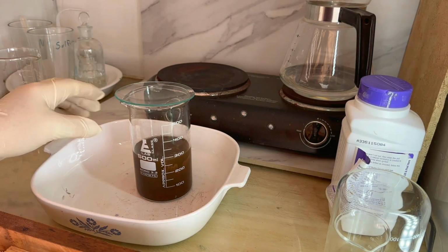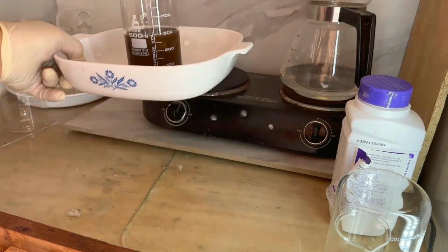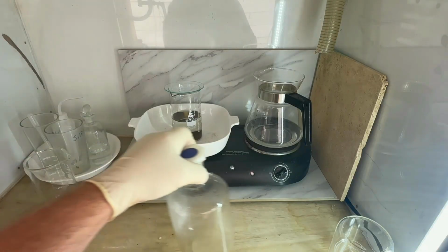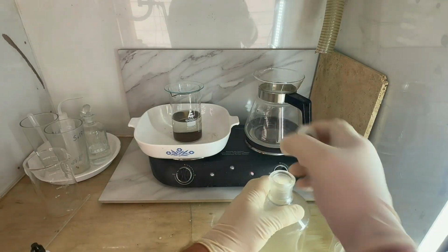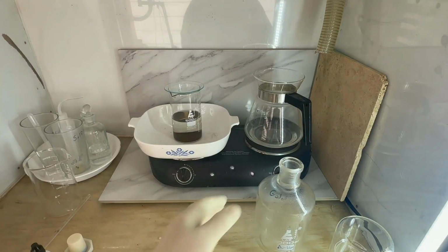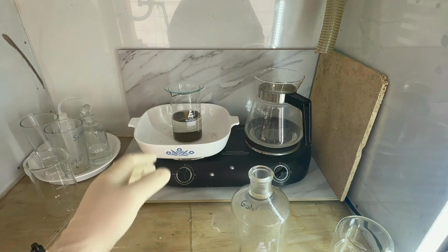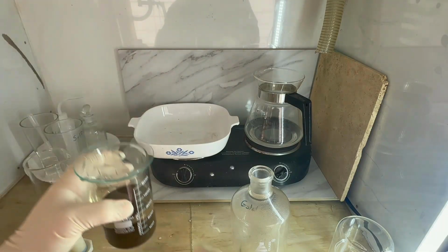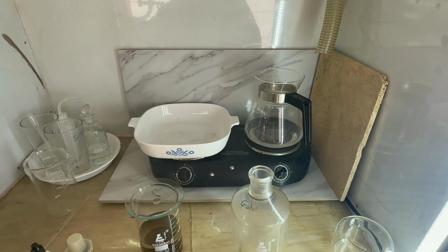Then we'll go ahead and set this up here out of the way. Let the gold settle. So the gold is settled nicely to the bottom of the beaker. Pull out our temporary stock pot again. And we're going to go ahead and decant this off and wash the gold. So first just going to pull that out. You can see it's a nice little layer on the bottom.